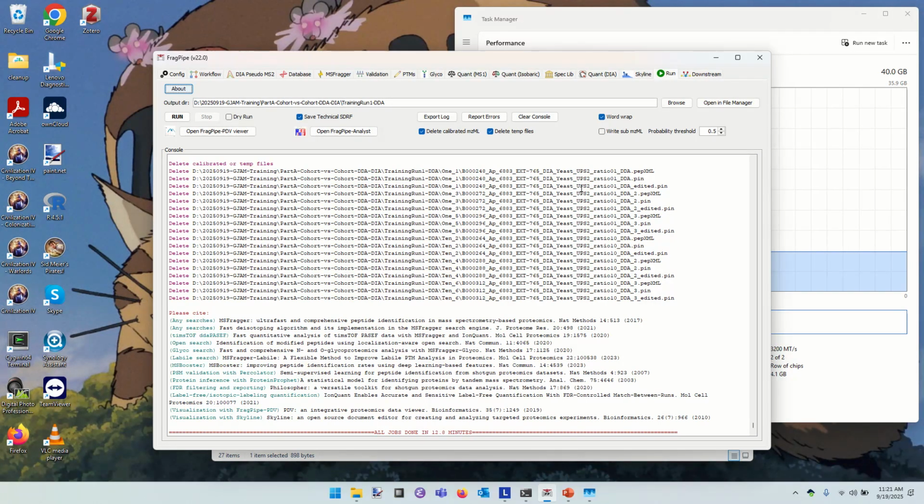We should be able to recapture the MS-MS for a given peptide 2 or 3, but ideally more like 10 times over the space of a chromatogram, which means that we don't just have the rise and fall of the intact peptide ion in MS1 scans to quantify on. That's what all that business was based on. Instead, we can look at the rise and fall of fragments attributed to this peptide as a function of chromatographic time.